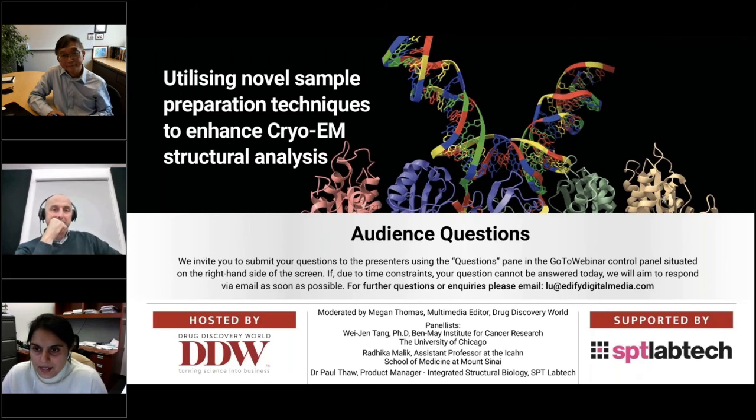So there were some side views, but we didn't have enough of them. So we had a very small proportion of the side views. So we could either go brute force and keep on collecting on our Vitrobot, or we could just optimize our sample for chameleon and get the thing done in one collection. So that's what we tried, both. I mean, we were ready to do it, but it was going to be a very tedious process, but chameleon worked for us. And it was able to give us enough more side views to have a good reconstruction.